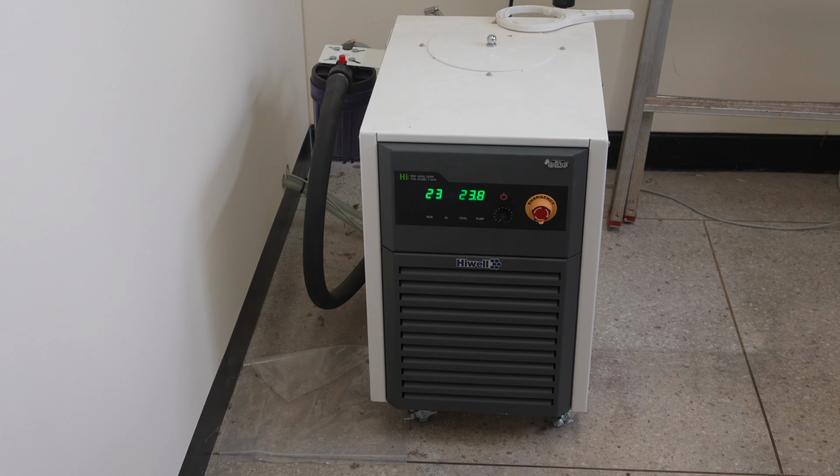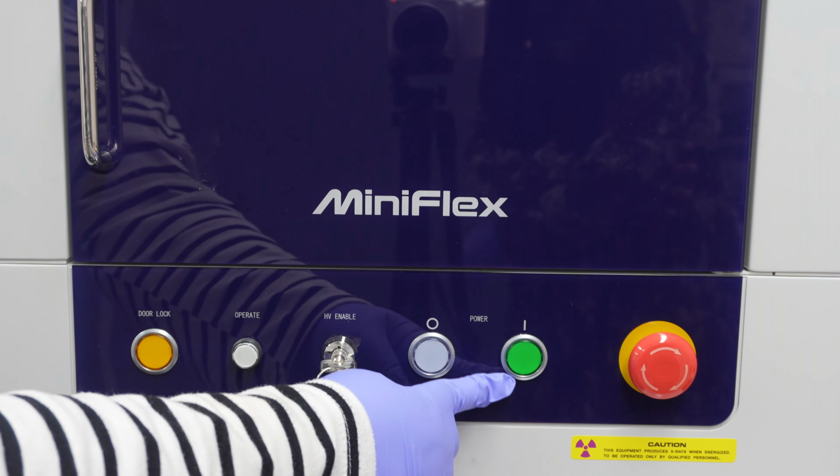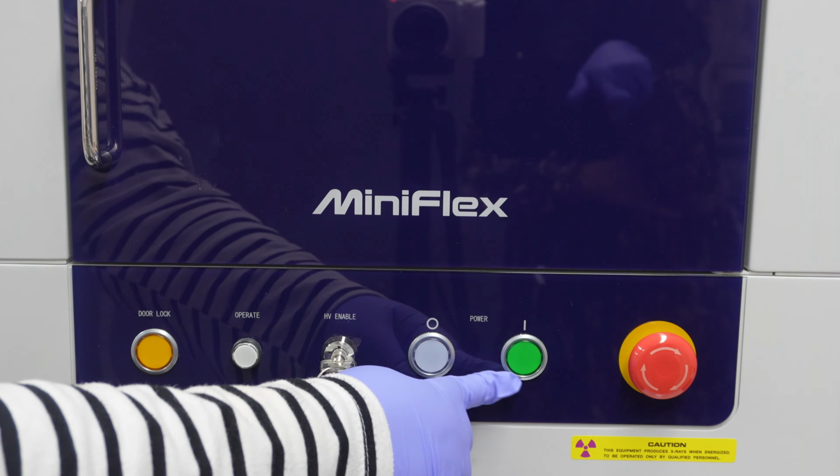Now we are going to turn on the XRD chamber. First of all, we need to insert the key and make it horizontal like this. And after that, turn on the power button. Here, the green one. Press, and then the indicator lamp on the left side will be on.